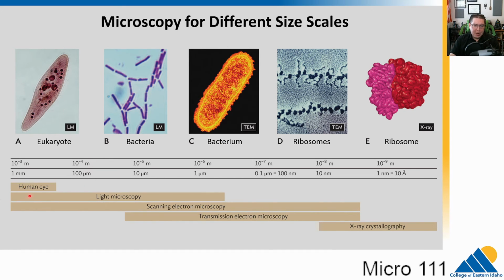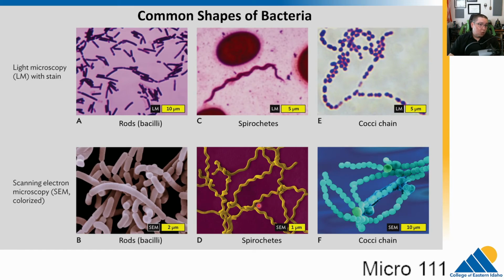We're going to focus mainly on the light microscopy section because we're mainly going to look at bacteria, and we'll also look at some eukaryotes. For viruses, you need electron microscopes. So what does this mean for us? Well, part of identifying a pathogen, right, is seeing it. So for us, light microscopy is a useful technique to do this.